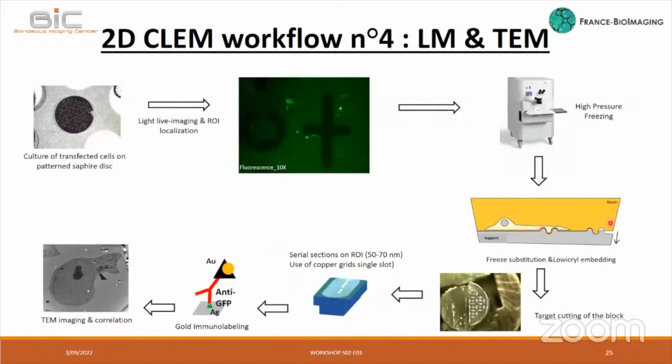And the last workflow I would like to show you. I don't have any application for this, but it's a workflow that we can do on the platform too. It's a combination between light microscopy and TEM using cryofixation first.